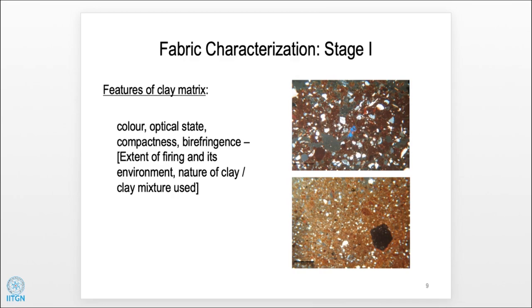So this is one of the sections, and here you can see this is 100 micron. Here this is also 100 micron. So it's a small area that has been magnified. And another one. You can see there is definitely a variation.